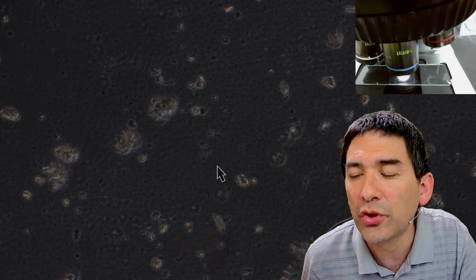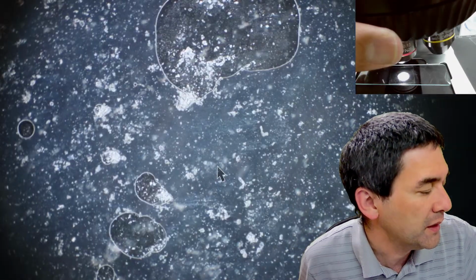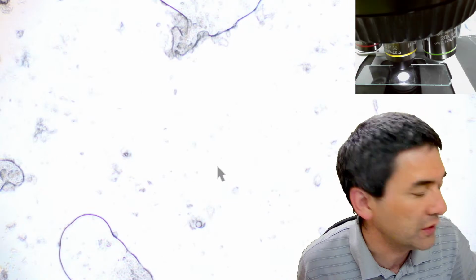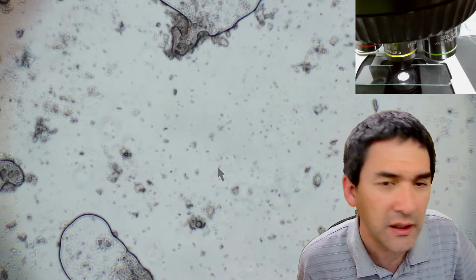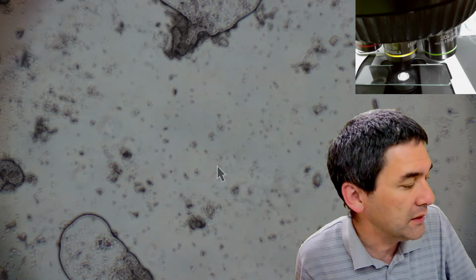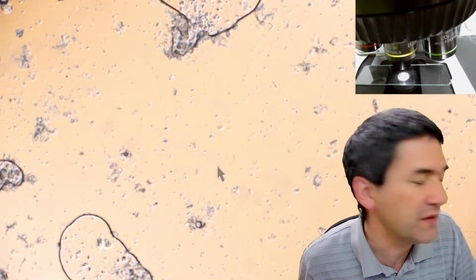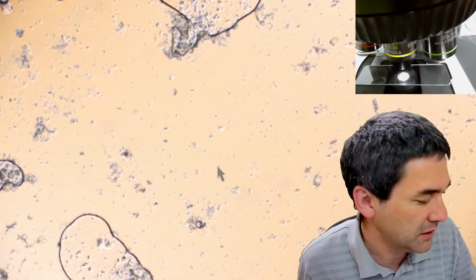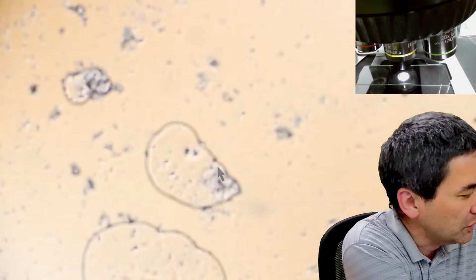Which other stains could you have used? Traditionally in microbiology, you can also use so-called gram staining, and this is a little bit more complex. You can use iodine for staining, but I would say that methylene blue is a very common stain because it's a very general purpose stain. Okay, but I think I'm just going to put the other one in here. We have something to look at.